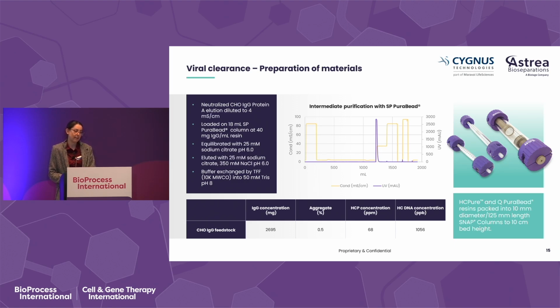And then they ran the column runs and the assays. And also they looked at additional things like carryover between runs, and also limit of detection to help us understand how we wanted to use these assays.